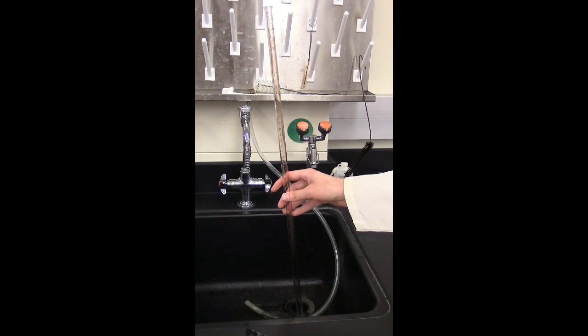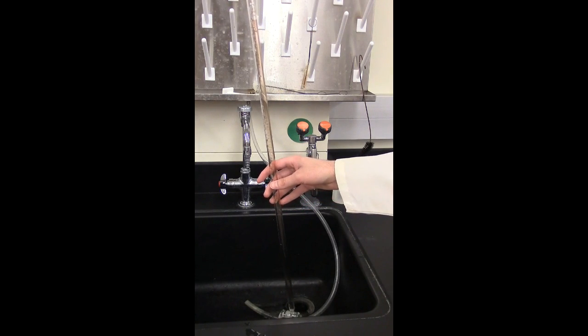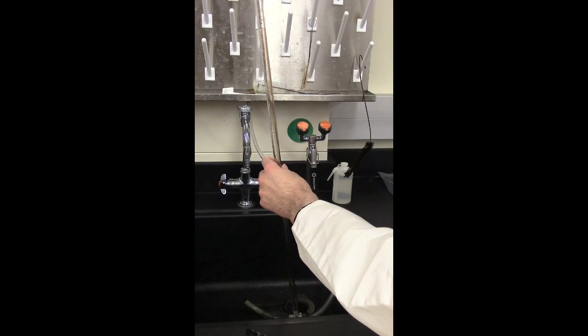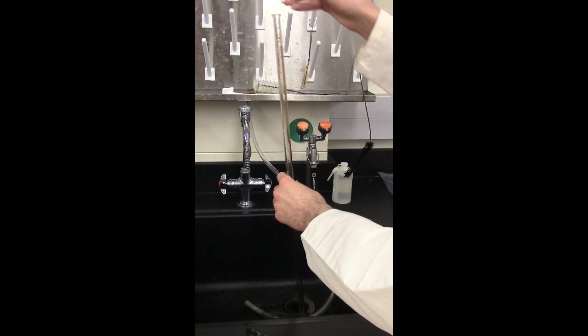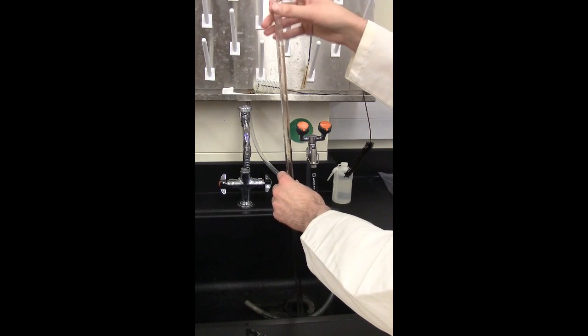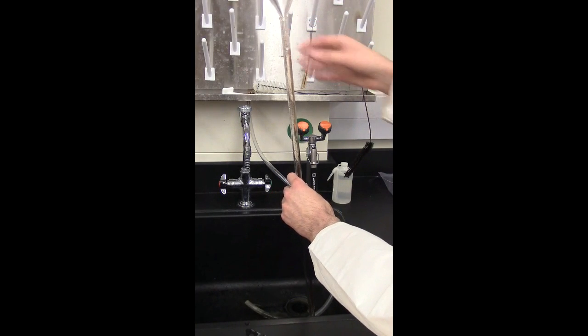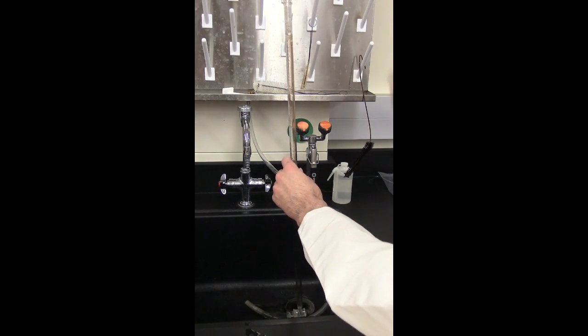The first thing we'll need to do once we obtain our buret is to rinse out the inside of the buret. You'll want to do this with whatever substance you'll be placing inside the buret. Normally it's either acid or a base, so whatever you're using at the time. We do this by placing a funnel in the top of the buret. Makes it easier to put the substance into the buret.